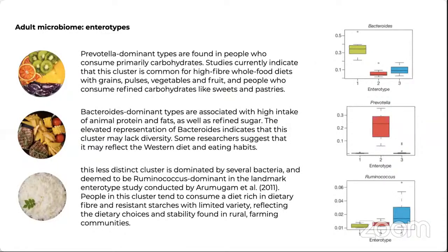That can be studied. So we will take a look at a couple of these practical examples, and in these examples, I want to highlight some of the important key findings and how we can perform some of the analysis using the OmicsLogic portal to arrive at these conclusions, and how we can leverage publicly available resources to generate a hypothesis. That hypothesis can be tested using a code-free environment to analyze the microbial or metagenomics data, and also using some code-oriented downstream analysis focusing on understanding the diversity of this microbial population in general, right?